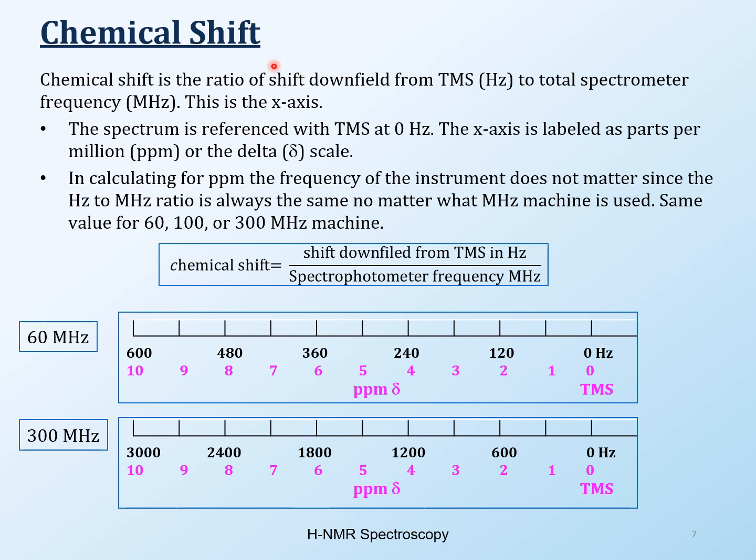So chemical shift is actually going to be in hertz, in a very raw way. Nothing has been doctored. If you're looking at the raw signal, it appears in hertz, and usually the instrument is going to be in megahertz. As I mentioned before when we were talking about the instrument, it can be 90 megahertz, or 300 megahertz, 1000 megahertz, whatever megahertz. So we're talking about a hertz scale on a megahertz radio frequency, so you can see how small that is. That's how it is.